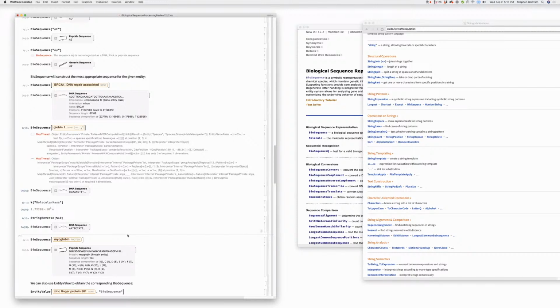Hey, Brad, what does Emerald do about this? Yeah, we would show the beginning and the end just for that exact reason. When I reverse it or reverse complement it, it's nice to just see that it matches up with what I expect. That's a good point for kind of visual confirmation, yeah. All right. Let's do 2/3, 1/3. 2/3 of the characters at the beginning, dot, dot, dot, 1/3 for the end. Do you get what I'm saying? John, you understand what I'm saying? I understand, yes. Okay.